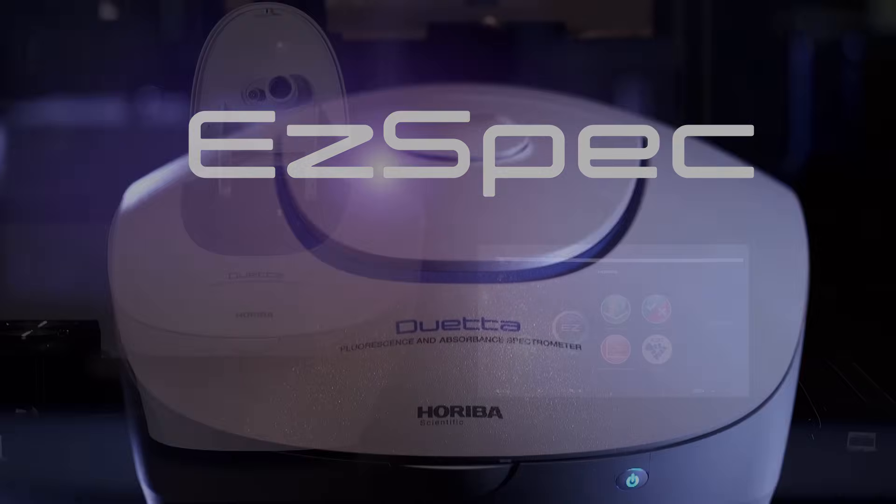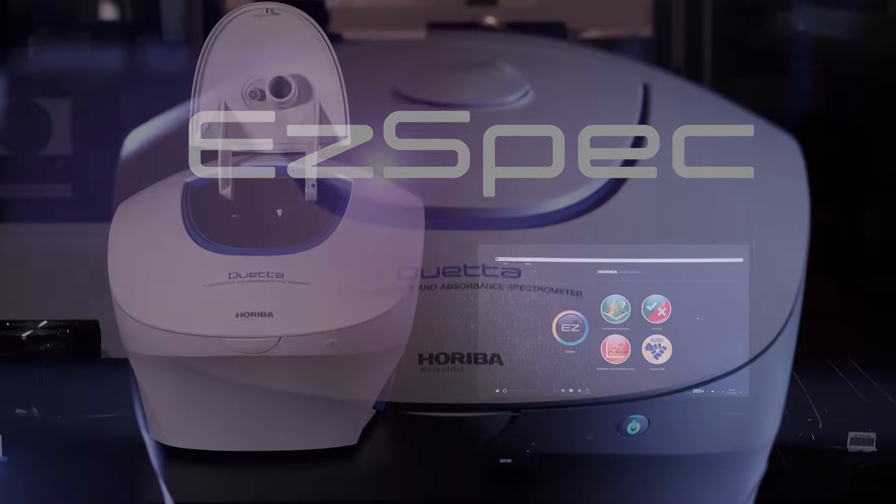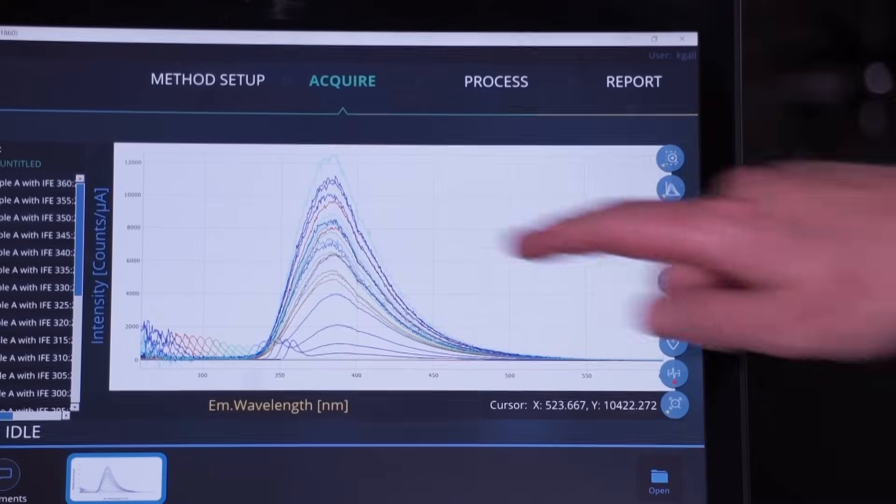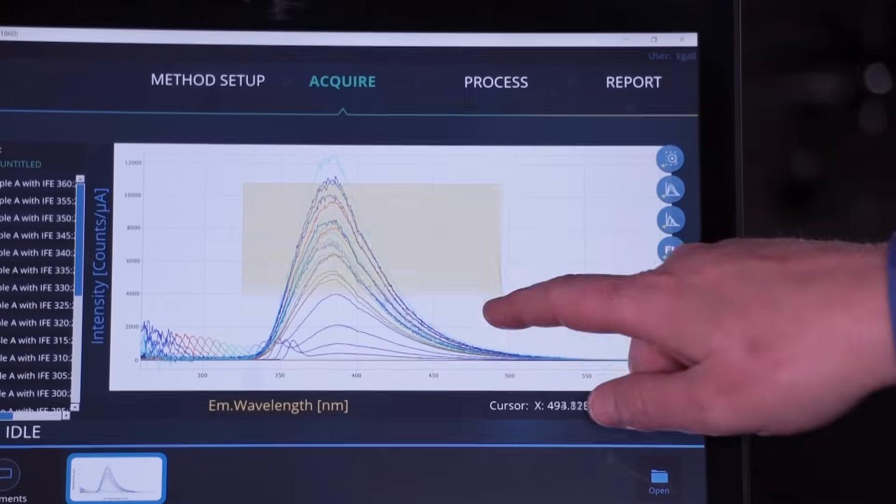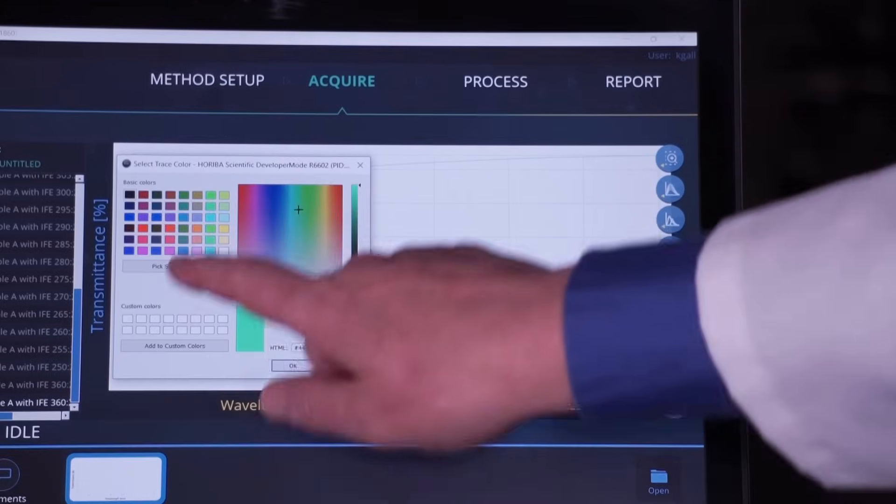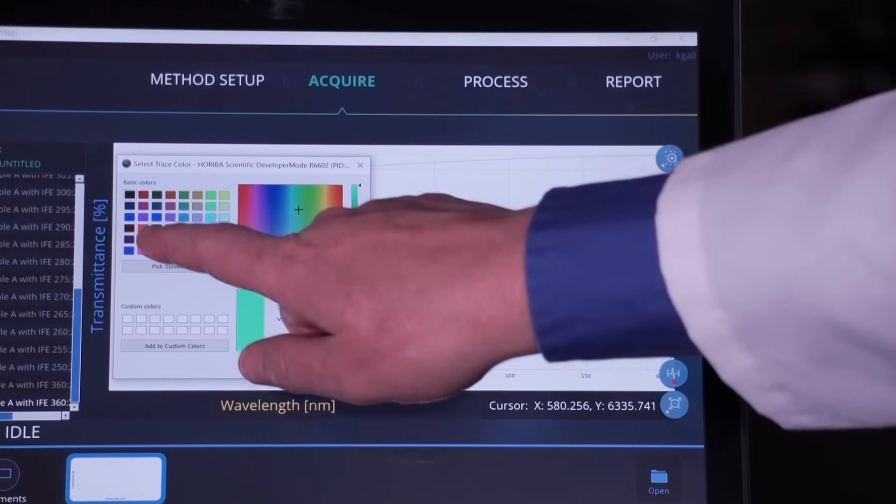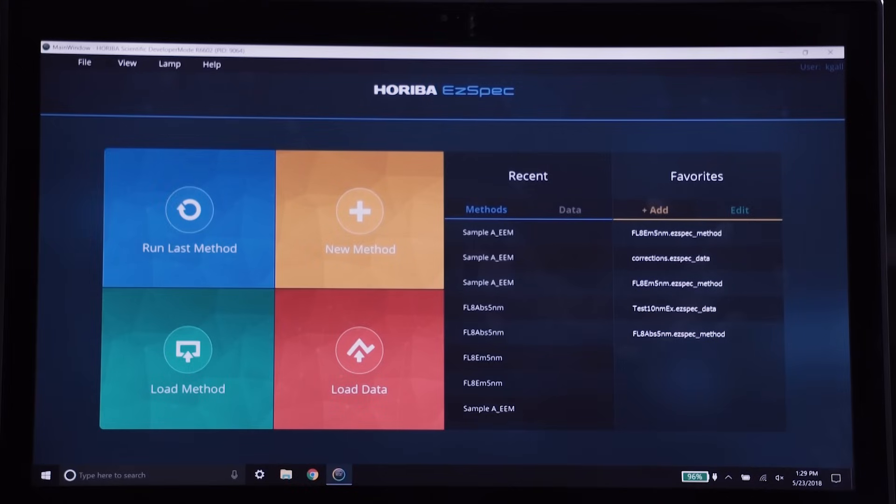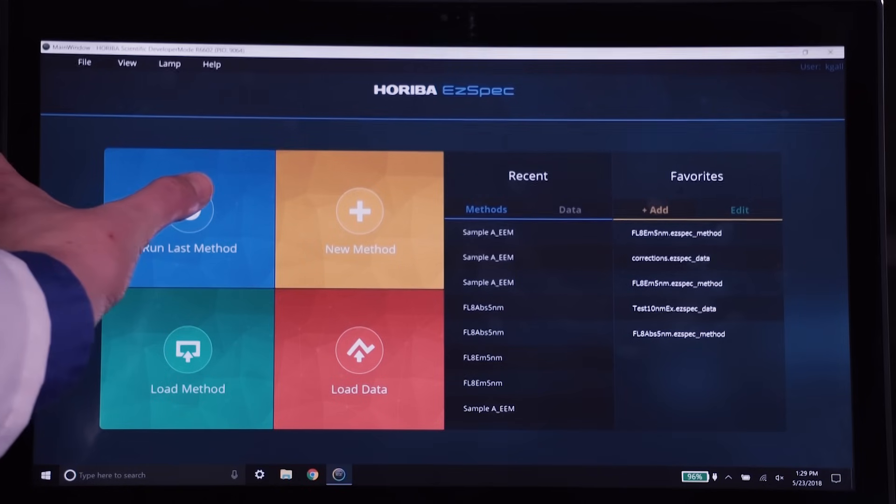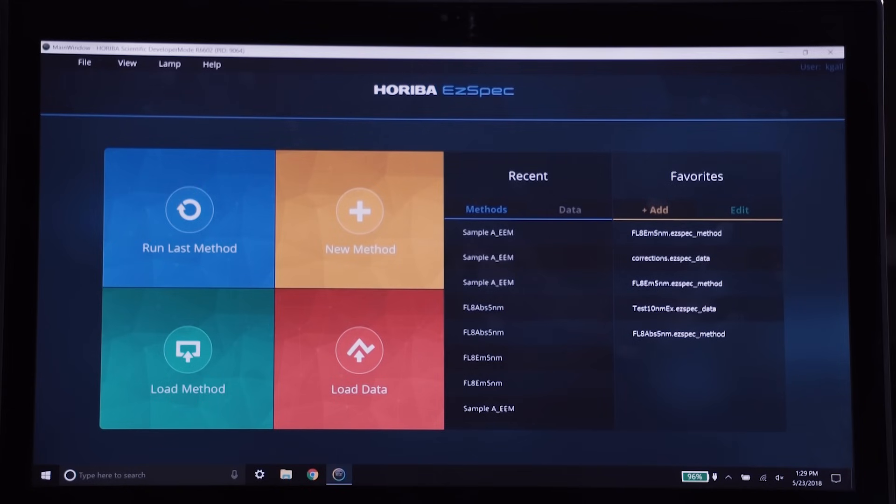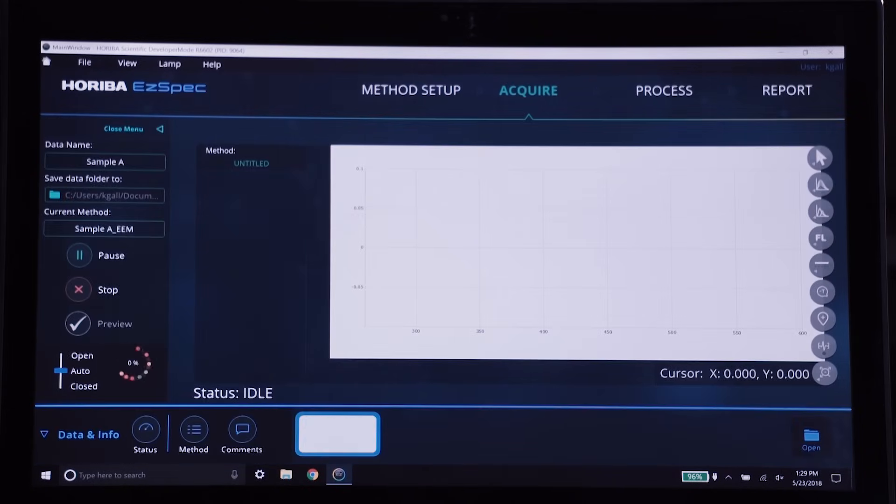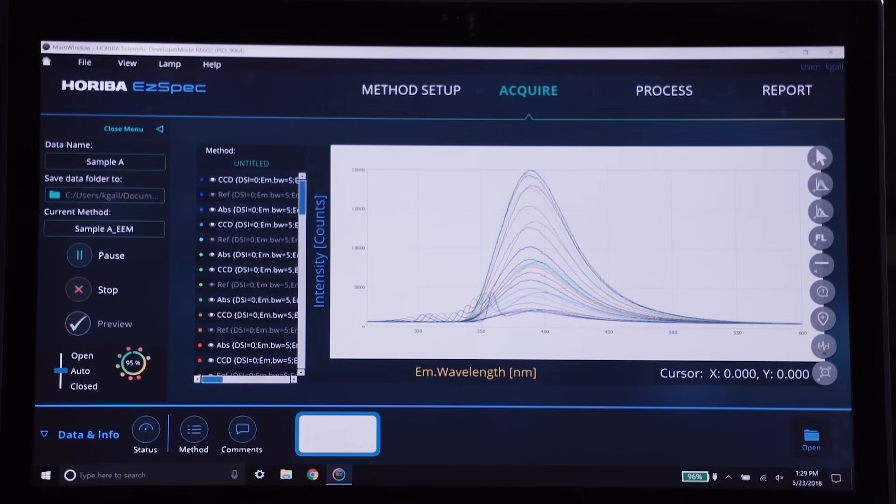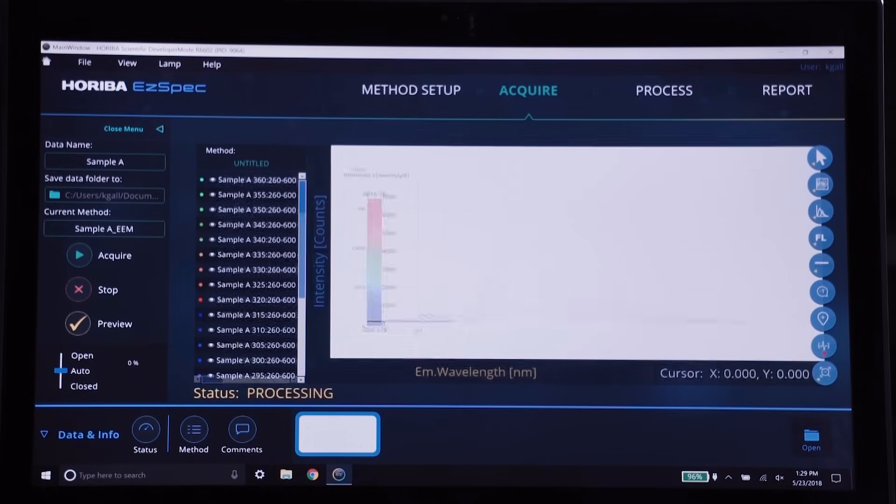This is the EasySpec software for Duetta by Horiba Scientific. This fresh take on user interface is an experience unlike any other platform on the market.